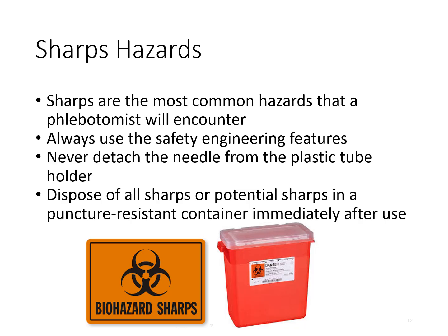Sharps are dangerous, both because of the physical injury they may cause and because they may also have a bloodborne pathogen on them, such as HIV, hepatitis B, hepatitis C. So we want to make sure that we have those properly contained so nobody is unintentionally exposed to those.